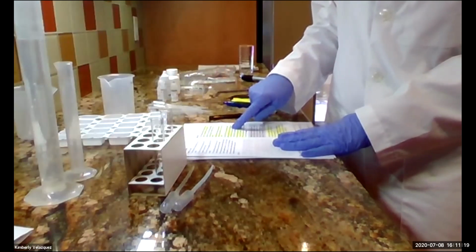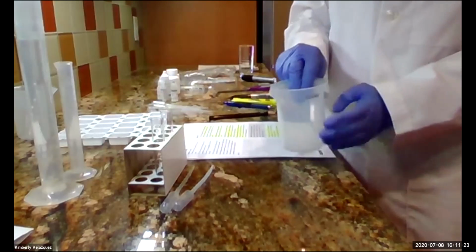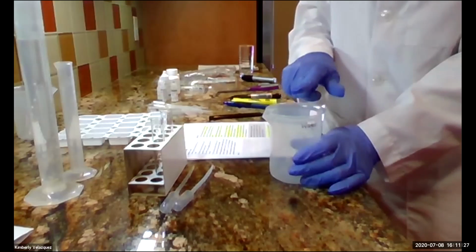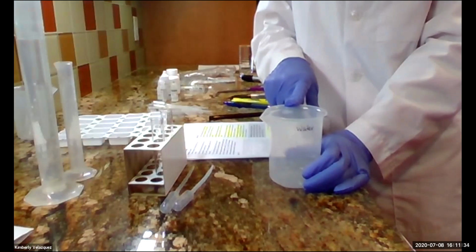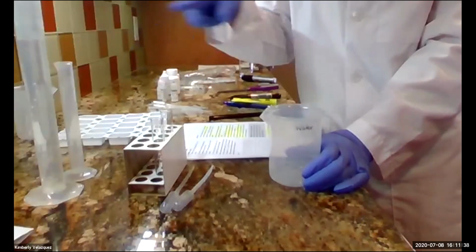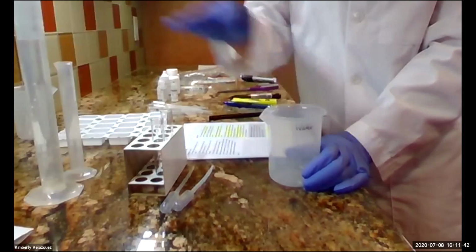Now you're going to get a beaker from your general kit and label that water. And you're going to add about 100 milliliters of water into this. Again, you can use tap water today. The reason they say approximately for this part is because you're just going to be using this to dispense water to make your dilutions. So they're saying you need about 100 mils of water.